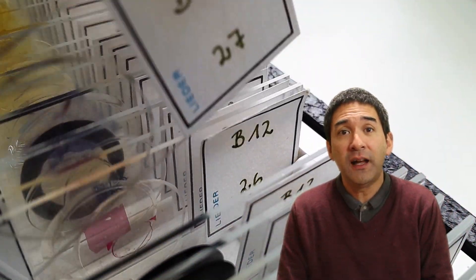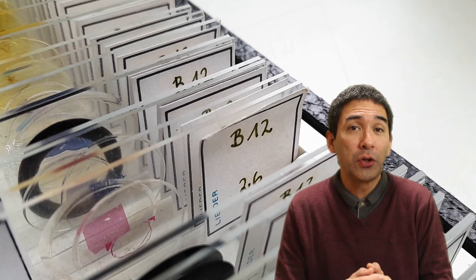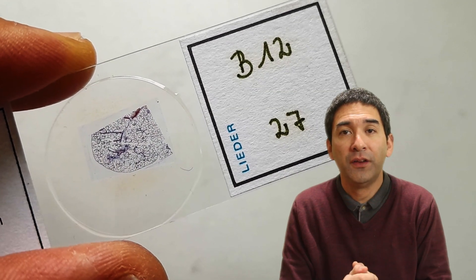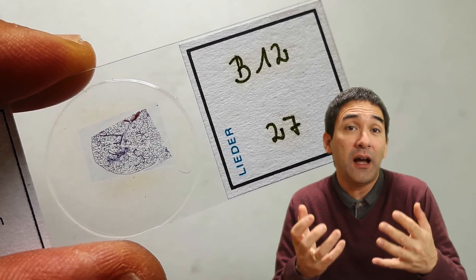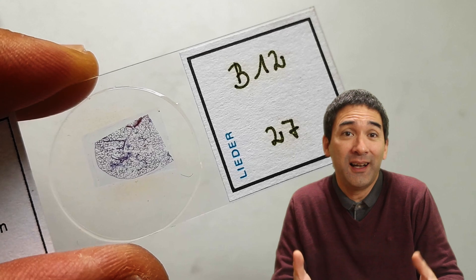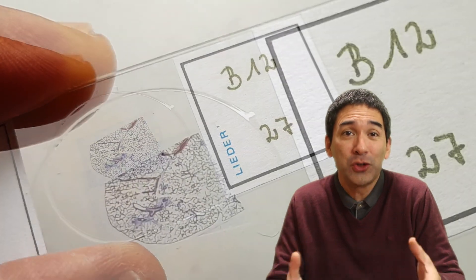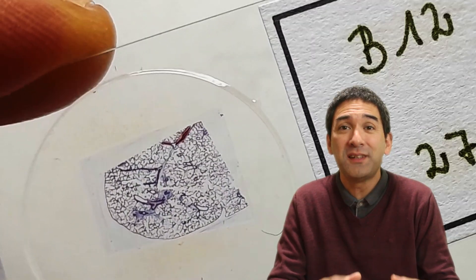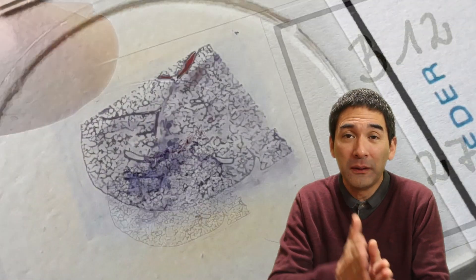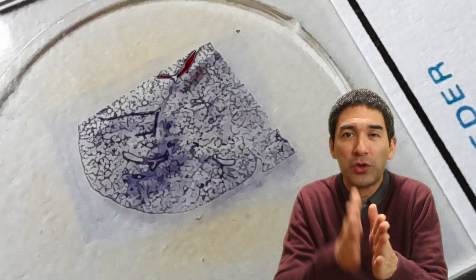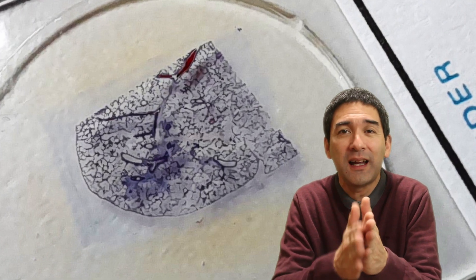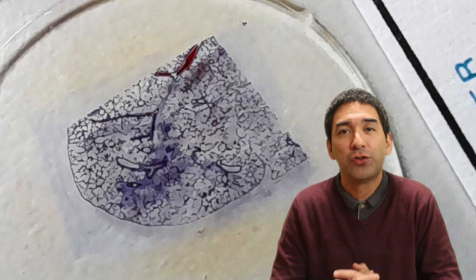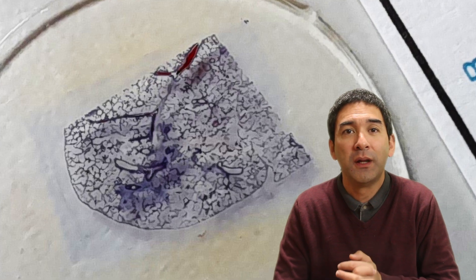This is the microscope slide we'll be looking at — it contains a thin cross section of a healthy lung. I did not make the slide; it's a commercially prepared microscope slide, so it's been properly stained and properly microtomed, which basically means sliced into very thin sections so that you're able to see all the structures very well.